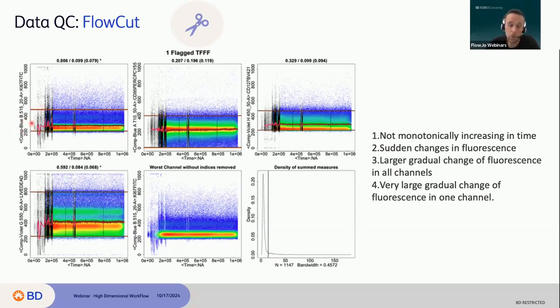And often those two lines really overlap. You can almost see the two colors here, the light brown a little bit on top and the brown line a little bit at the bottom. For example, on this one, the light brown and dark brown overlap, but on the second percentile the two are slightly separated.